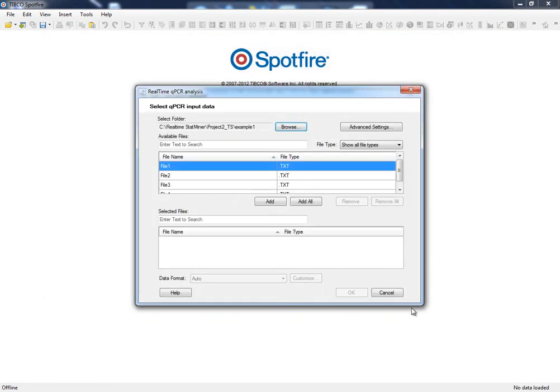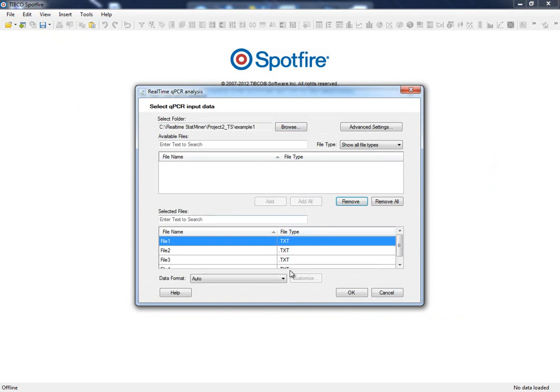StatMiner detects common formats from various platforms, but in some cases our qPCR input files might not be automatically recognized. In this instance, we need to help StatMiner to determine where the information can be found within our data files.